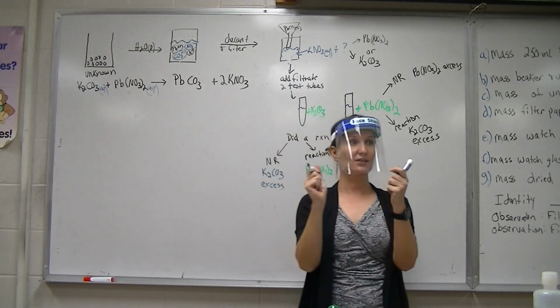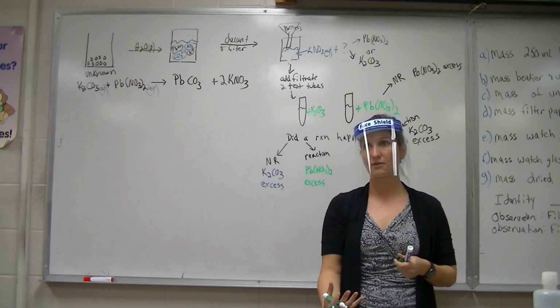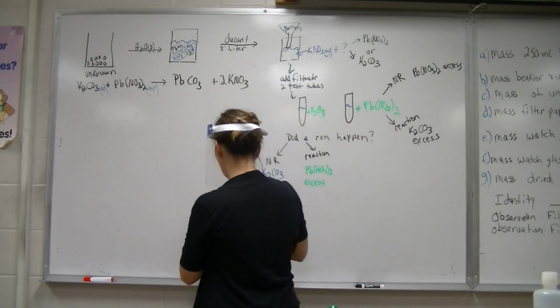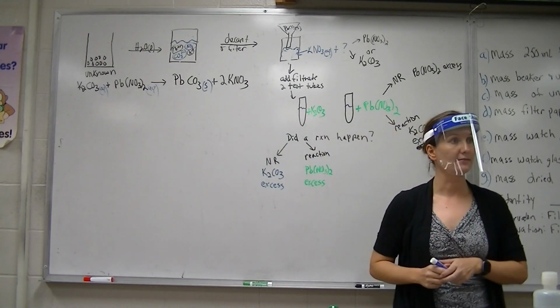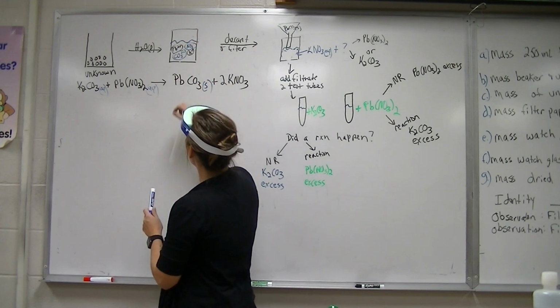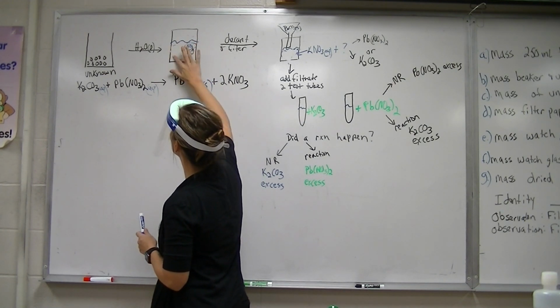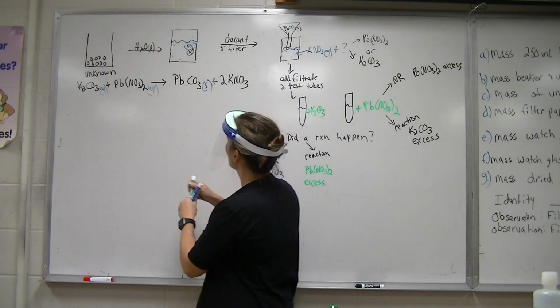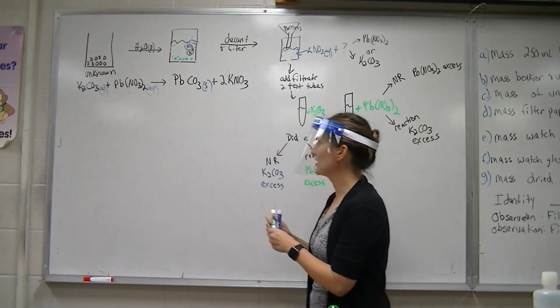Once they touch each other, they're going to form a bond and precipitate out, because this is actually a solid in water. It's not aqueous, it doesn't dissolve, it's not soluble. So when those two combine, it forms a solid, so we no longer have those ions floating around. Instead, we have a solid precipitate at the bottom that is that lead(II) carbonate.